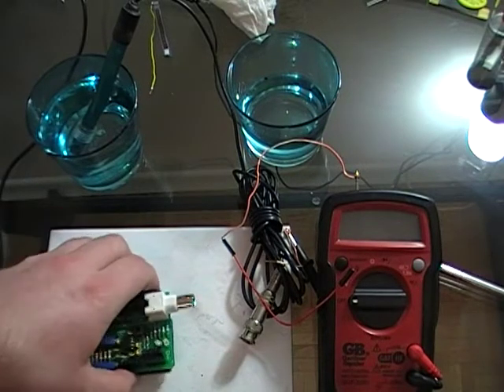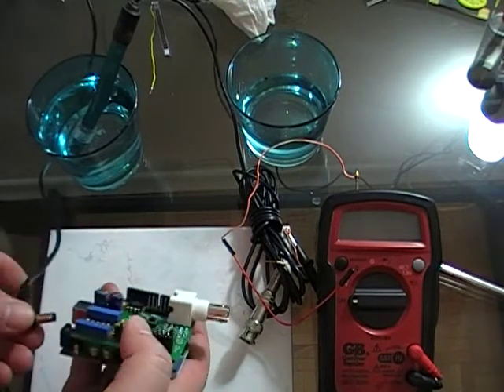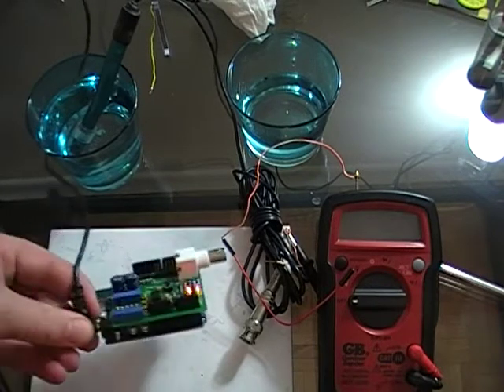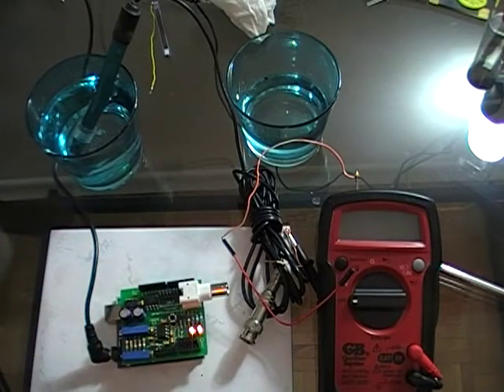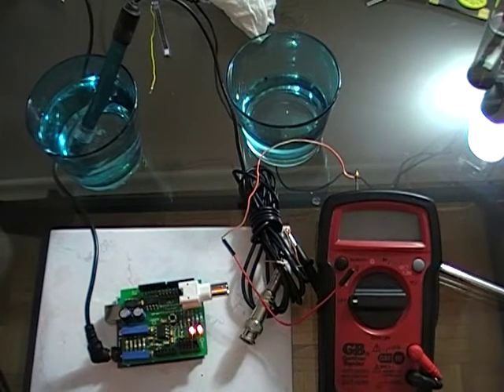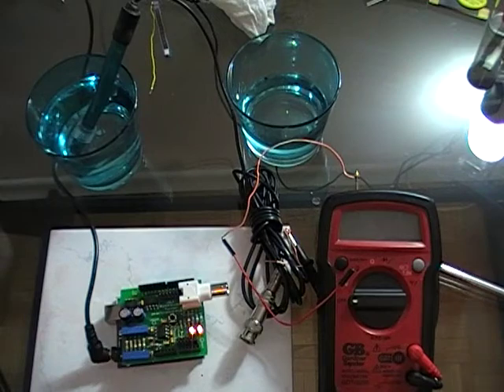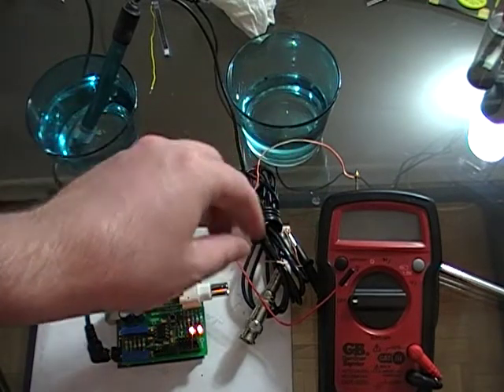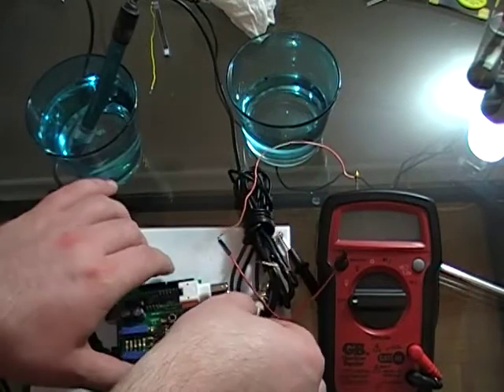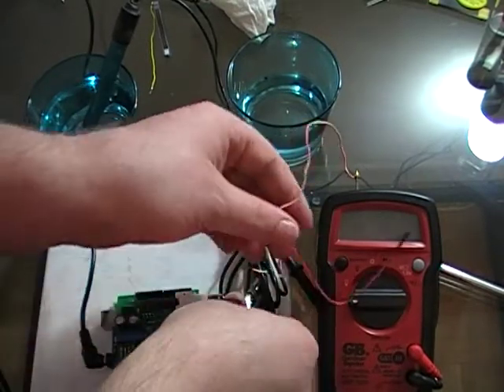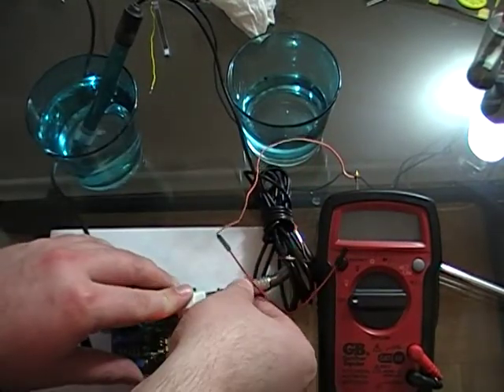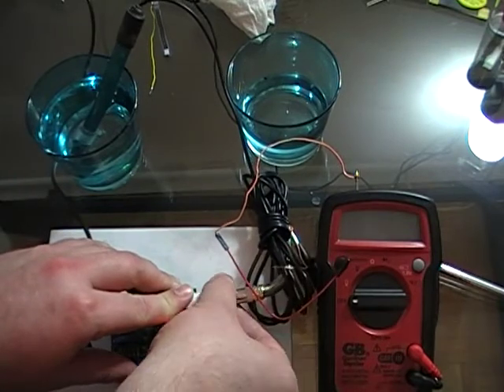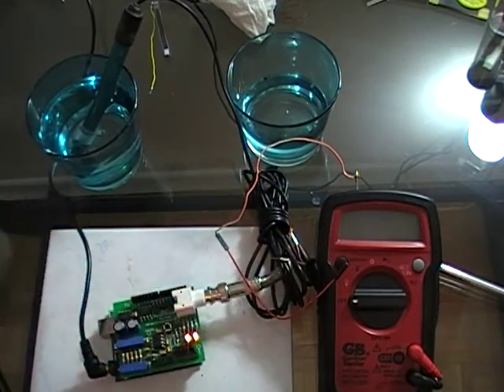So we're going to hook up the power. You can do this without a multimeter, however for the first time you use it it's much easier to use the multimeter than to use the Arduino. So we're going to hook the pH probe up to the BNC connector.